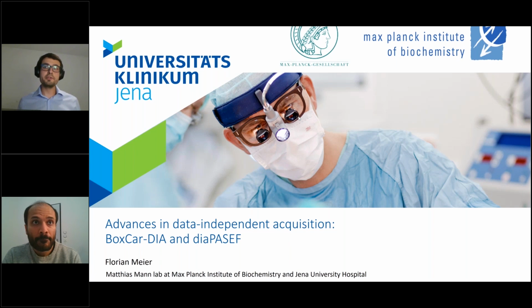Yes, I think that's really one of the use cases that we now could basically take any library, maybe a pan-human library that was acquired without an ion mobility device, and we could now just in silico add this additional dimension to this. I haven't tried it yet, but it would be very interesting to see how that works. Okay. And what other kind of things could you imagine using this prediction for? I guess as a score potentially. Yes, I think it's definitely an interesting thought to use this as a score. I'm curious to see how that works out.